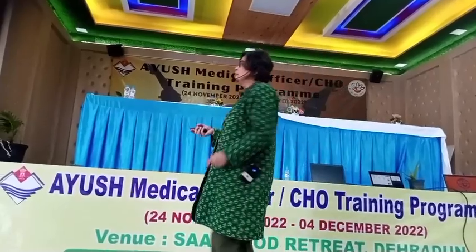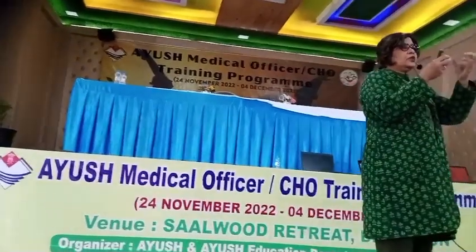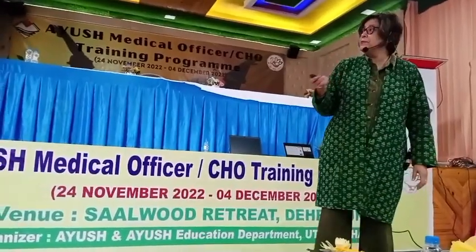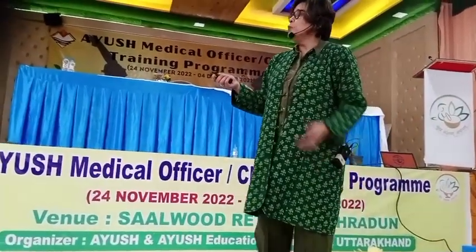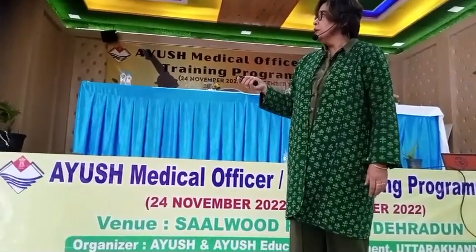Then the other containers we have are for urine, sputum and stool. For stool, a spoon comes along. The rest, urine, comes in a small BD container type for collecting samples or urine samples. Sputum can also be put into this container because these are sterile.